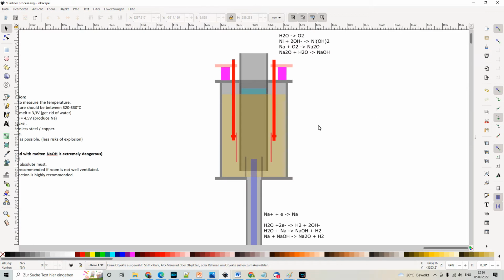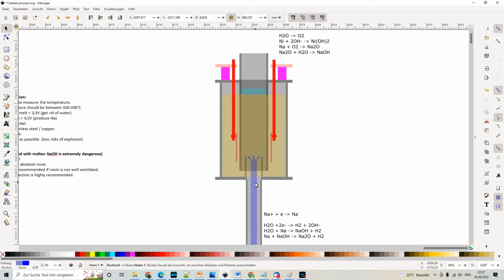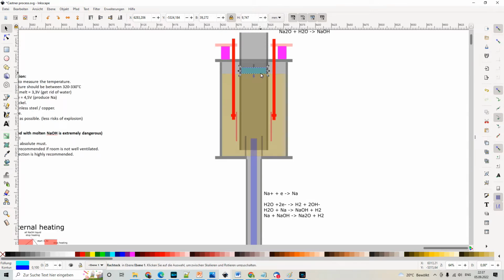So before I continue to show you some more pictures, I want to explain the basic functionality of the Castner cell. What you see here, this red stuff, that's basically the anode. This blue thing here, that's basically the cathode. And the gray stuff is just normal stainless steel, and it's not connected to the anode and not connected to the cathode. Here, what you can see should depict the molten sodium hydroxide, and this stuff should depict the liquid sodium metal that formed.